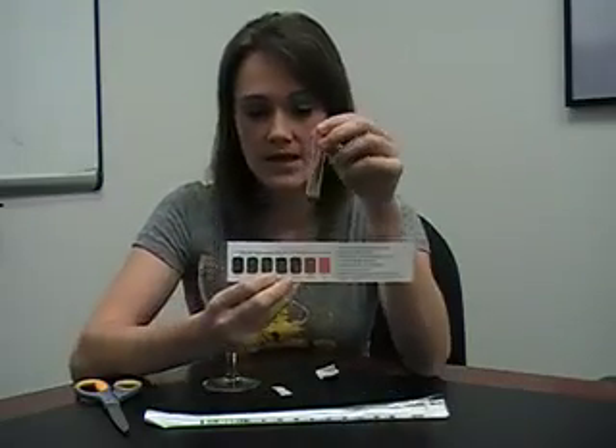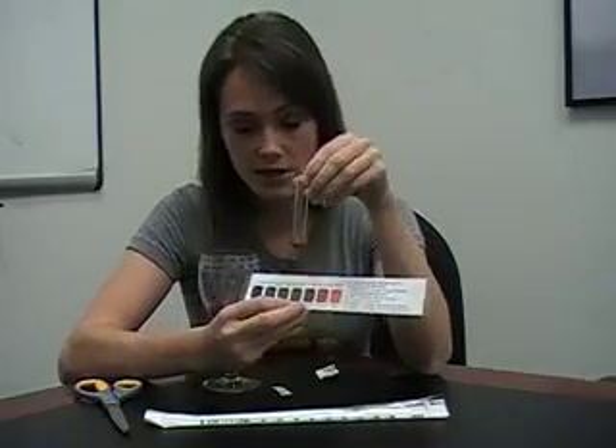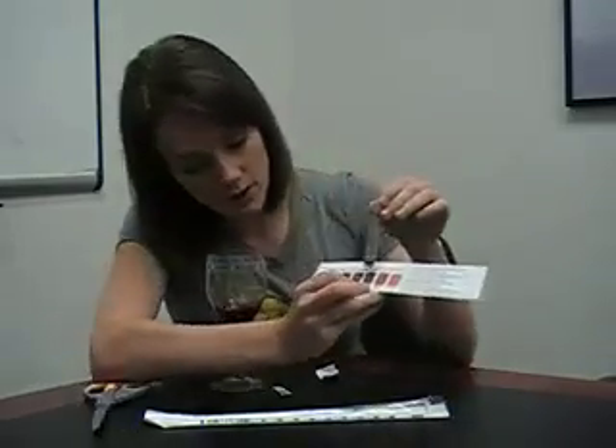Then as it cools, about 30 seconds after it boils, we compare it to the color chart and we're looking for it to be about 0.4 or less. If it's 0.6, wait another day before testing the residual sugar again. But if it's at 0.4, like this sample is at 0.4, we're ready to add the malolactic culture and start malolactic fermentation. And that's how you do a residual sugar test.